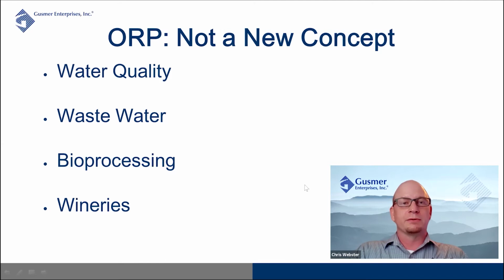And that was really due to some studies that were done by Dr. Gordon Walker, as well as assistance with Hamilton at some high-end wineries in California. And what they were looking at was using ORP to manage fermentation and prevent those fermentations from going reductive.